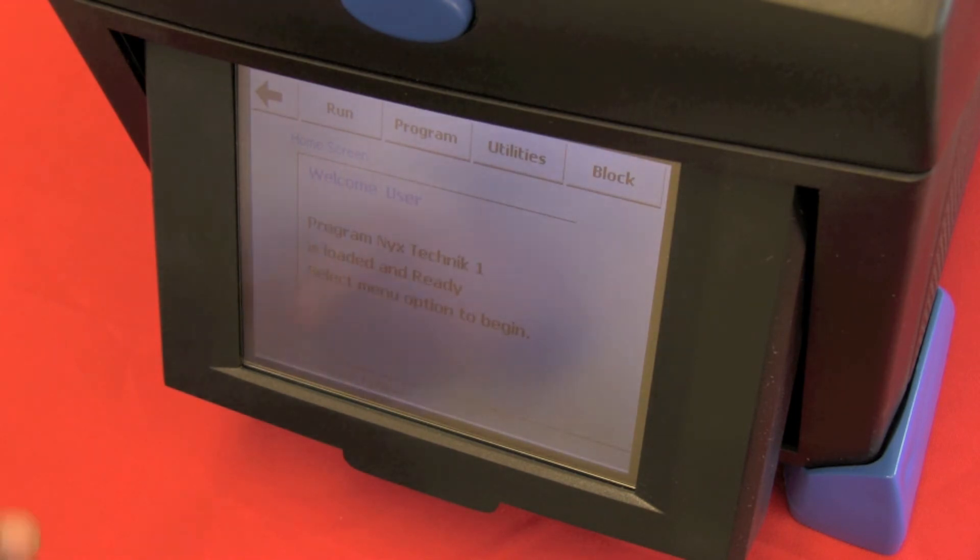Let's take a look at some of the menu options. We'll start off by looking at the run option. Now here, you can start the current program, which is the last program you ran. You can load other programs which you've programmed into the device, and you can view your current program settings for any program that you might have run in. Finally, there's the incubator option at the bottom.